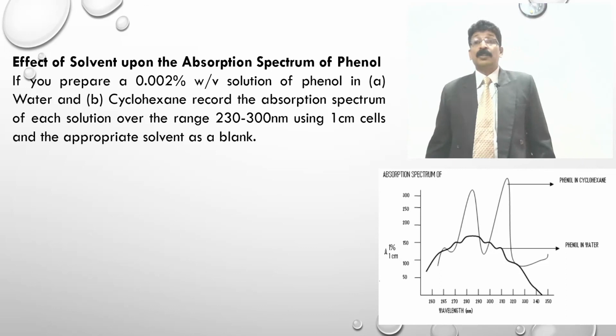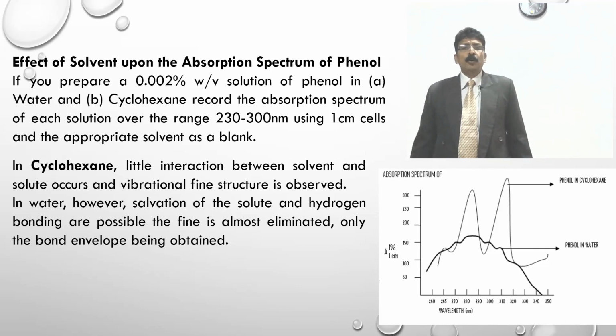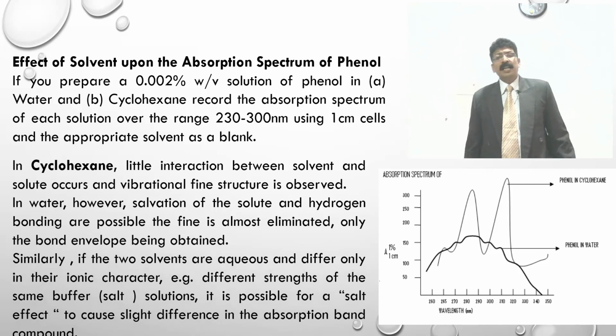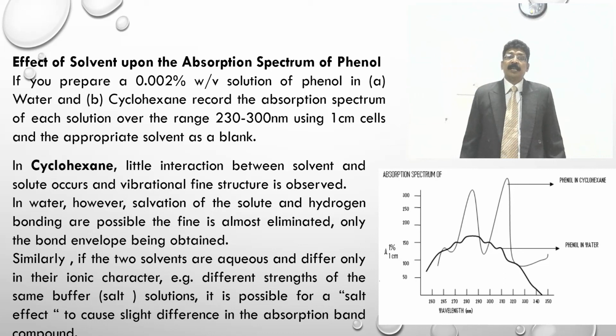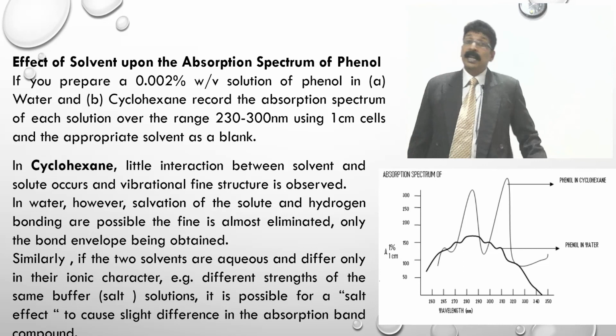So in cyclohexane, little interaction between the solvent and the solute occurs, and vibrational fine structure is observed. In water, however, solvation of the solute and hydrogen bonding are possible, and the fine structure is almost eliminated, only the band envelope being obtained. Similarly, if two solvents are aqueous and differ only in ionic strength, for example different strengths of the same buffer solution, a salt effect is possible. It causes a slight difference in the absorption band of the compound. You can see the picture which I have shown here, that clearly there is a peak in cyclohexane for phenol.